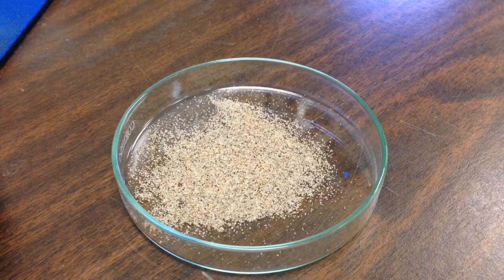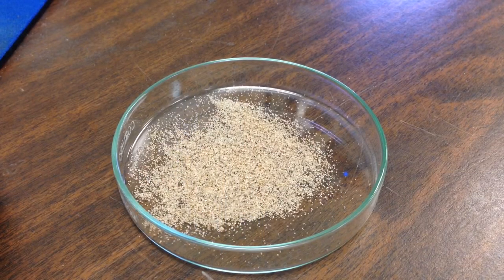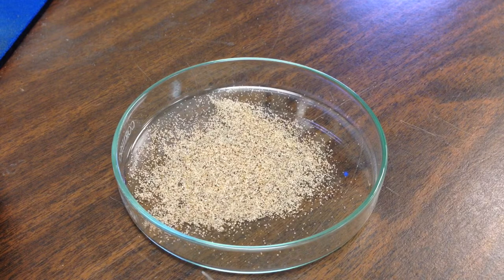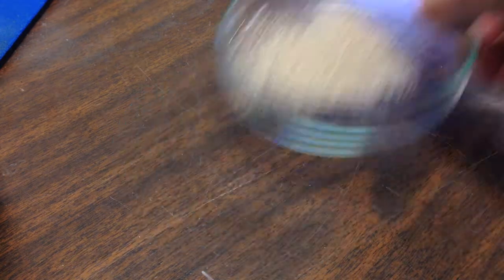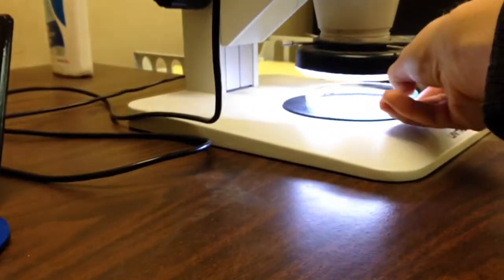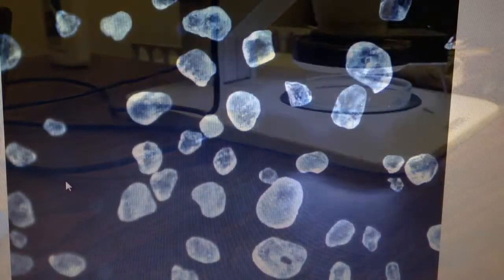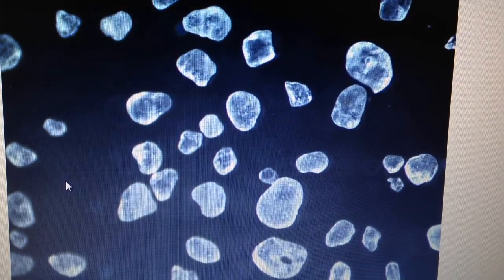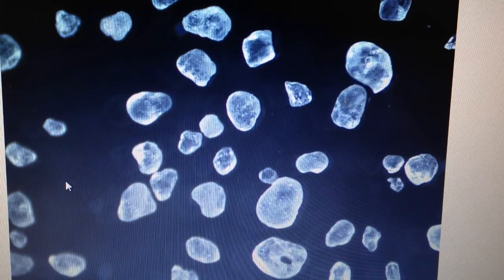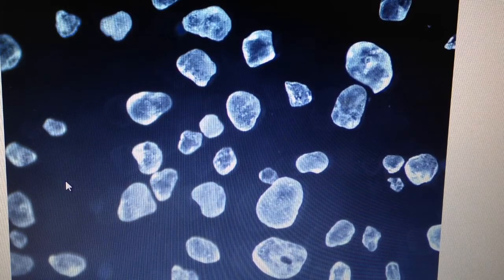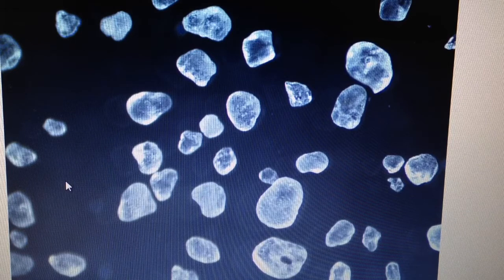To perform this analysis, we take a small amount of sand, anywhere from 1 to 15 grams, and we go ahead and place it underneath a microscope. From there, we search for a spot that has at least 20 individual grains of sand that aren't overlapping or touching each other, so that we can have a full, clear view of all the edges and we can accurately make a judgment of the sphericity and roundness properties.